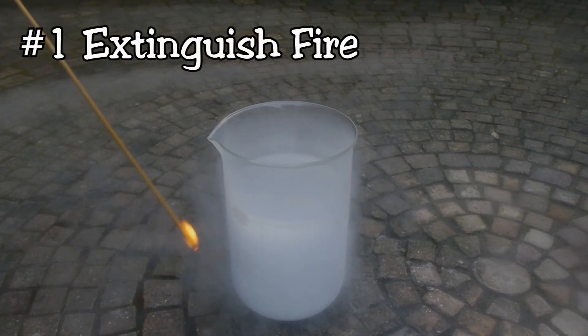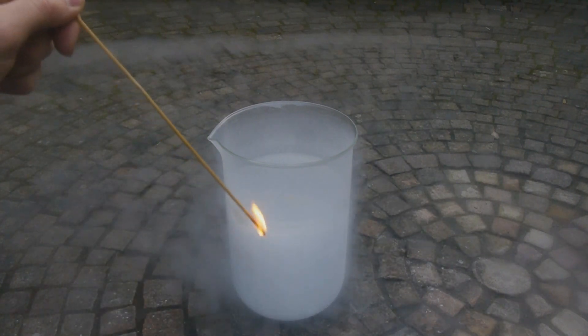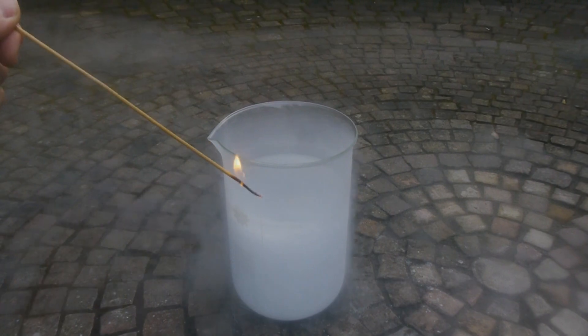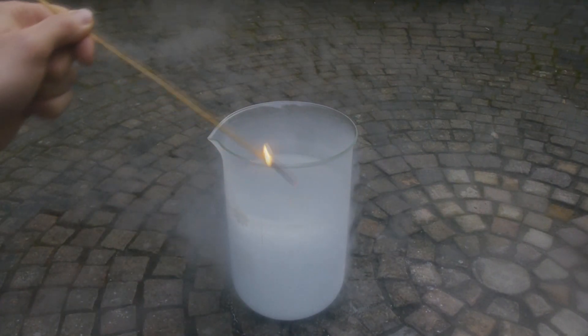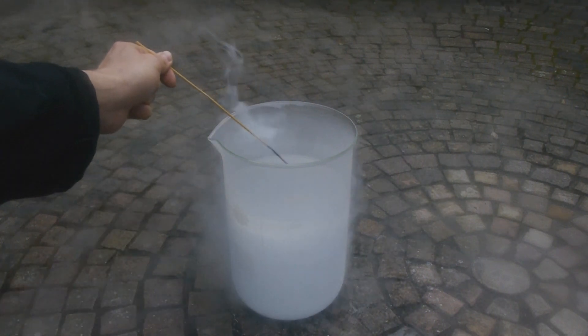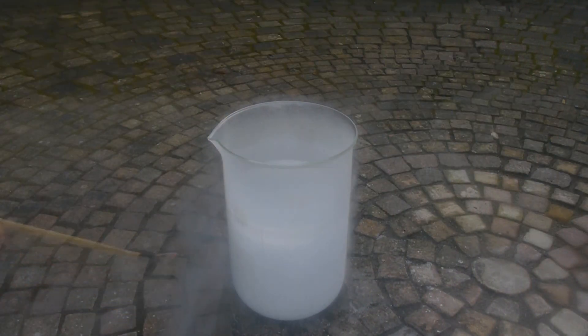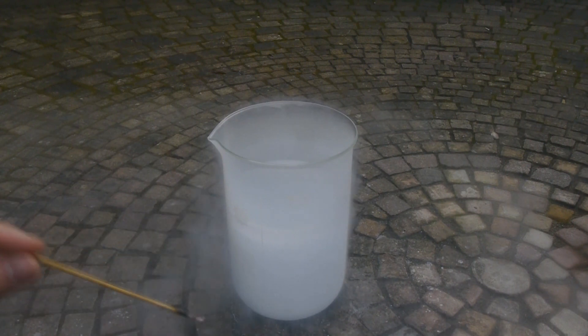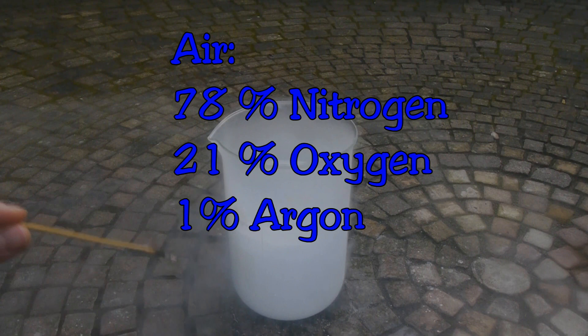Now we all know that things are able to burn in regular air. The question is, can they burn in liquid air too? And the answer is a bit more complex than you might expect. If you just try it and take a wooden splint that's burning and put it in liquid air, you can see it immediately extinguishes before it even touches the liquid. Now why is that? Because air is a mixture of gases: 78% nitrogen, 21% oxygen.